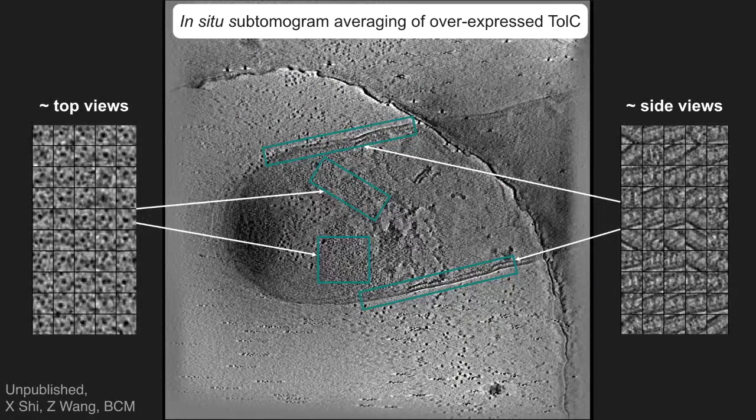And you can see here these little specks that are floating around. Those are the complexes from the end-on view. And you can see here, these are side views. So these are the two membranes, and you can see things spanning the membrane. Now, you say, well, these are just black specks. How do you know what these things are? Well, we've done a bunch of different ways. You do control studies. If you don't overexpress these complexes, then the black specks vanish, and other things as well.